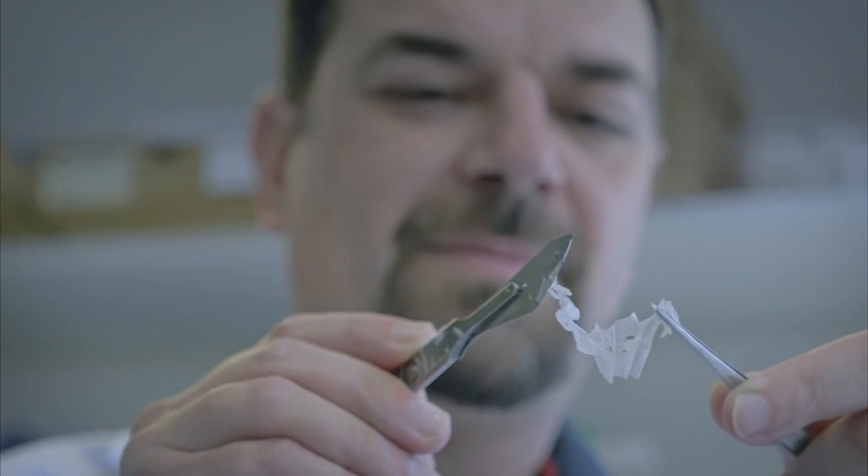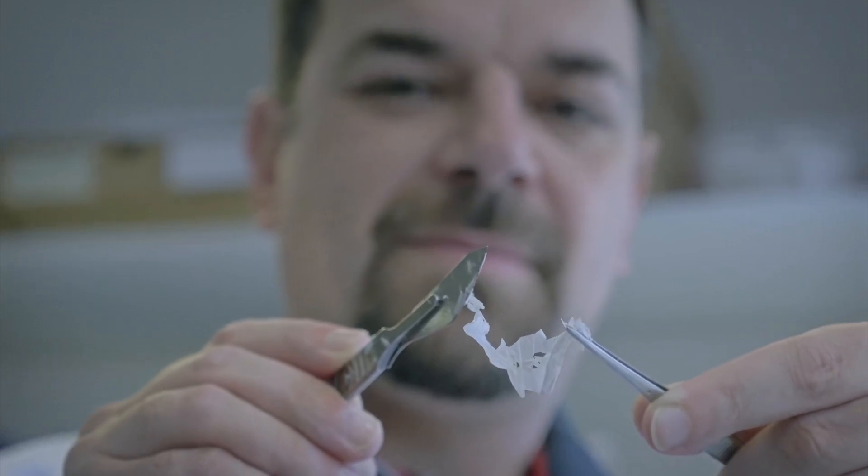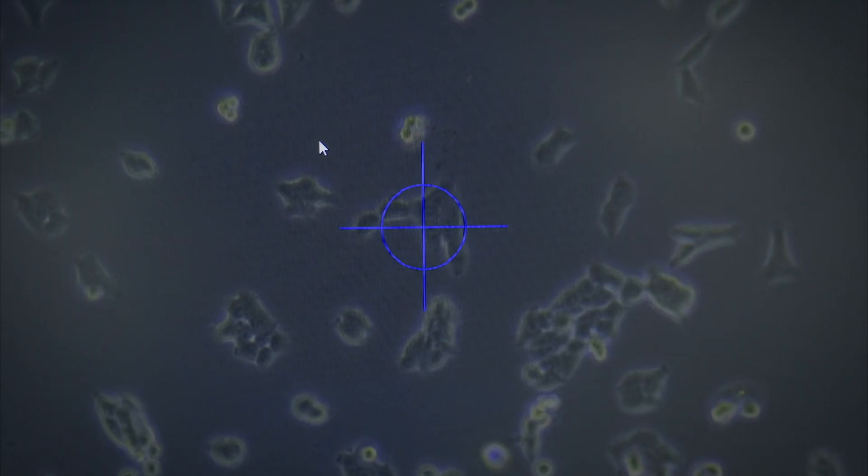Brillouin microscopy gives us information we need to more fully understand the physics of life. Through it, we can visualize and model in three dimensions.